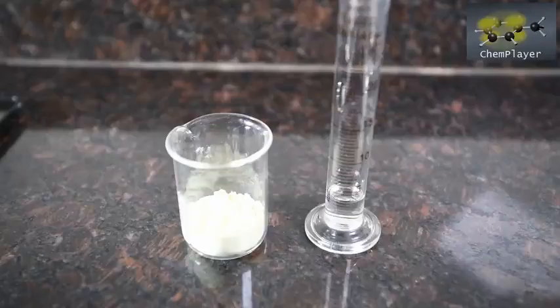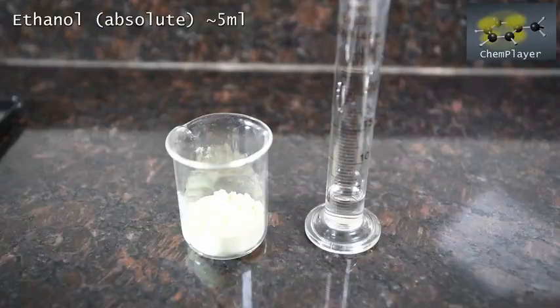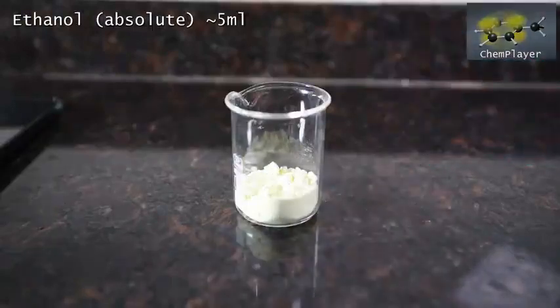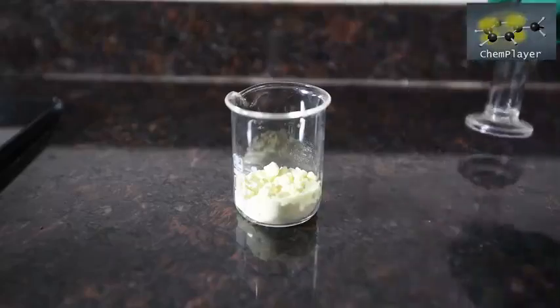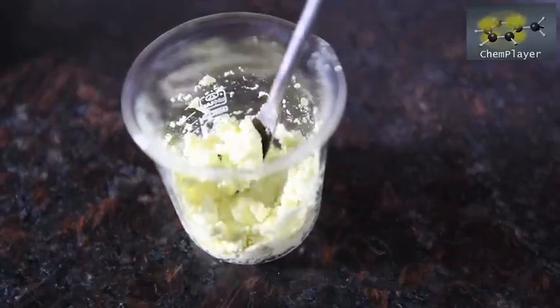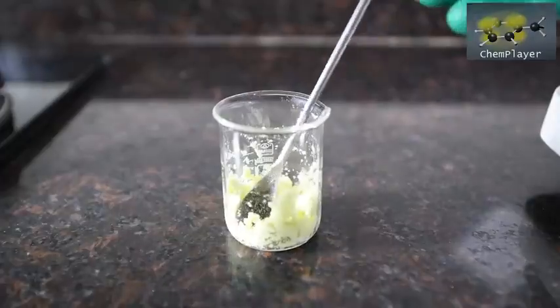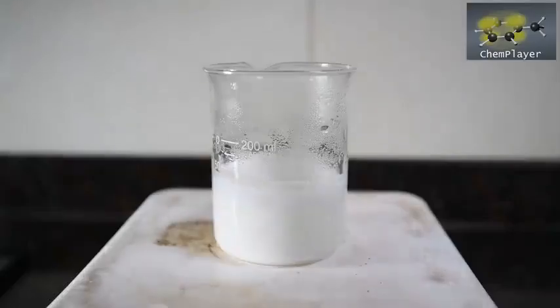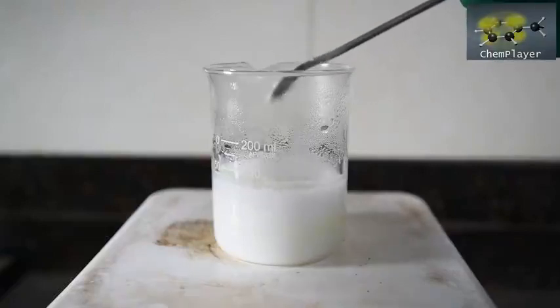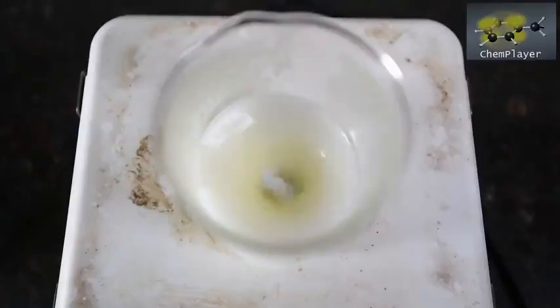To stop the sulfur being a bit hydrophobic and clumping when we add it, we're first going to wet it with about 5 ml of absolute ethanol. This step might not be essential, and who knows — maybe you could try using vodka instead. We've got a paste of sulfur now, so let's start adding it. Nothing exciting happens; the sulfur just goes into suspension together with the sulfite.